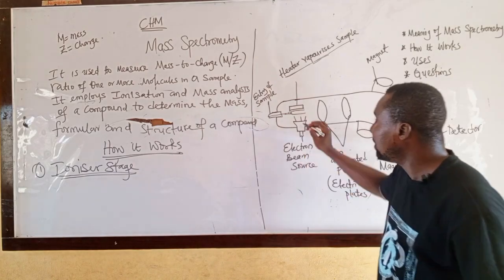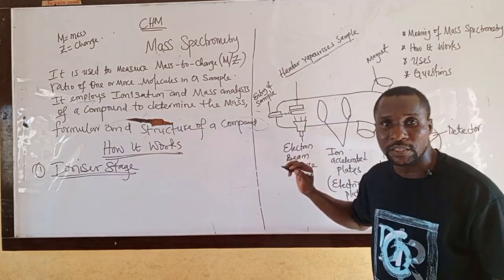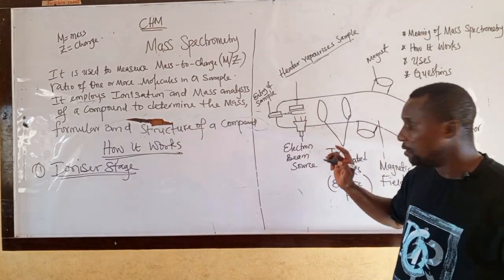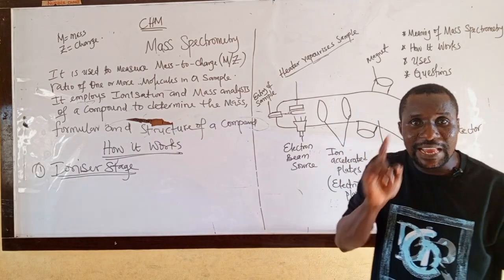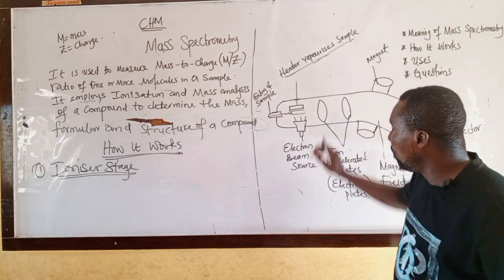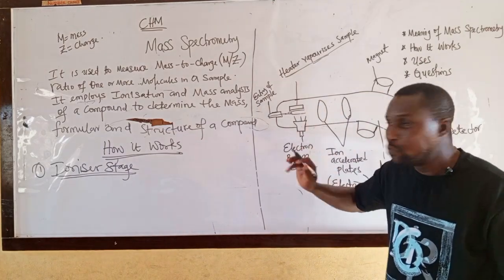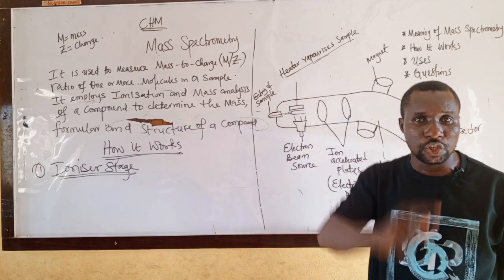Then after that, the vaporized sample will be bombarded with electrons, and the electrons must have high energy. The vaporized sample will be bombarded by high energy electrons.